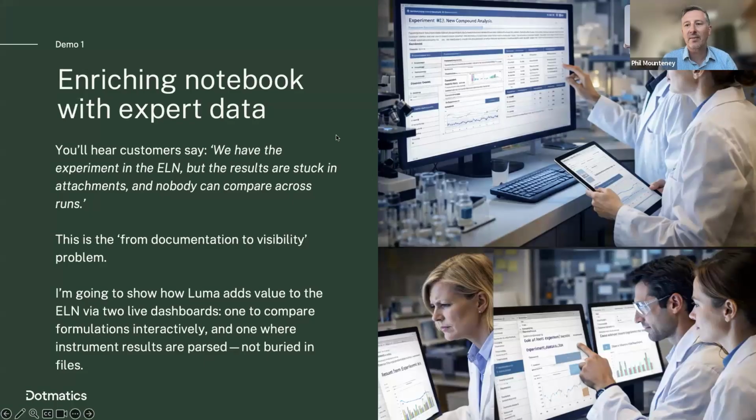So I'm going to talk to you really about three demos today and how we can use our Luma platform along with really any ELN, but of course we'll use the Dotmatics ELN to talk about today. The three demo scenarios I'm going to talk about are bringing expert data into Luma. So that's breaking down data silos, bringing in things like instrument data, Prism data, really any data that you've connected into Luma and bringing that into the notebook. And then I'm going to talk to you about how we can do the reverse, how we can take notebook data and bring it into Luma to really power decision making and with agentic skills. And then I'll talk to you about how we can actually build really quite complicated workflows across a notebook with all of the connected systems that Luma brings to bear.